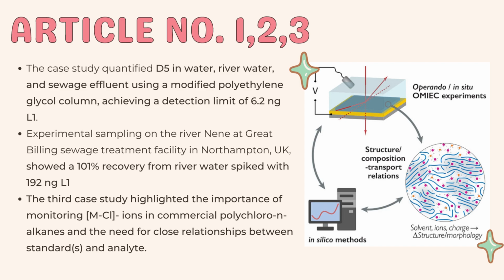Diclofenac was identified as a pharmaceutical residue in all sewage plants. The study highlighted the importance of monitoring ions in commercial polychloroalkanes and the need for a close relationship between standards and analytes.